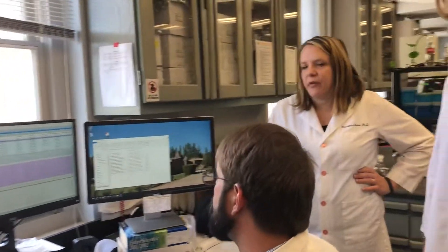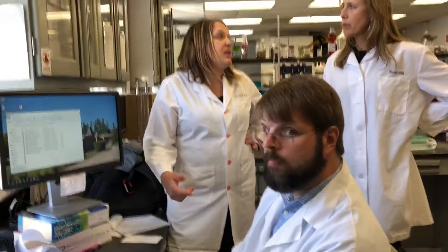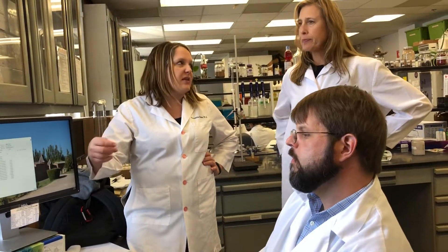It was then run on the flash chromatograph, and one of the fractions from the flash was injected on the HPLC. So it's already been through three rounds of processing before it gets to this stage. We're going from hundreds of compounds down to groups of tens of compounds, and through this process we're isolating individual peaks and single compounds.